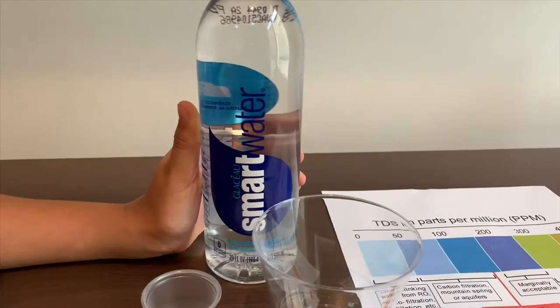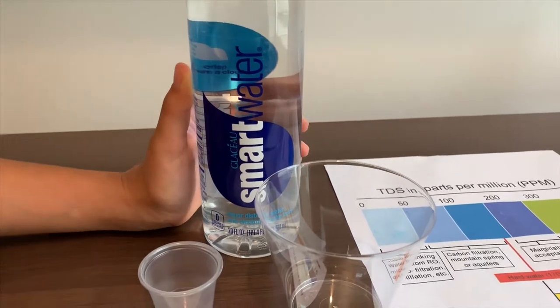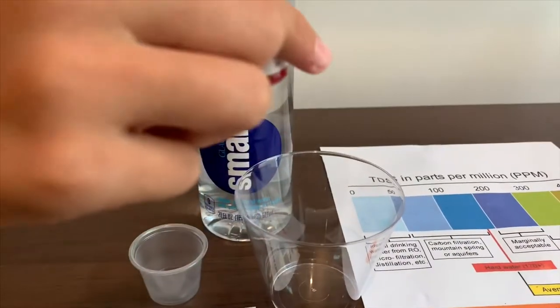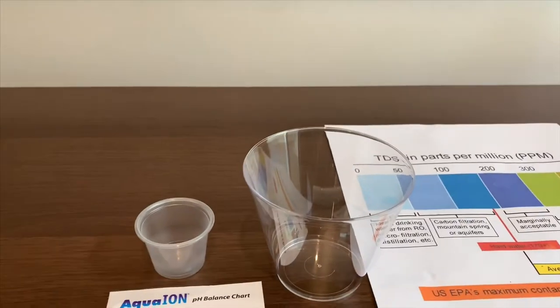This is Smart Water. It is distilled water and it has electrolytes added. We're going to test the TDS level and the pH. First, let's test the TDS level.